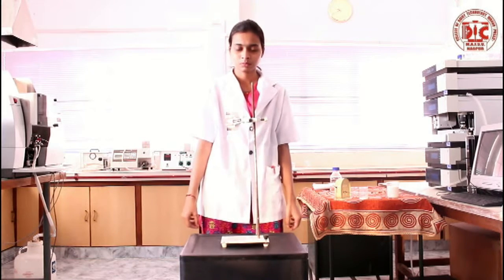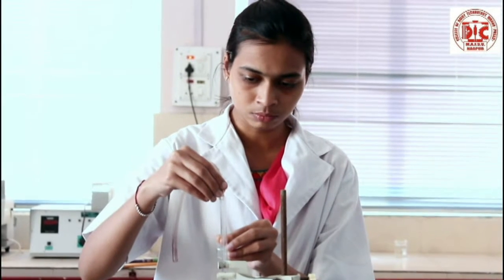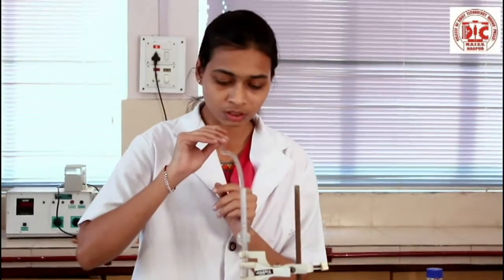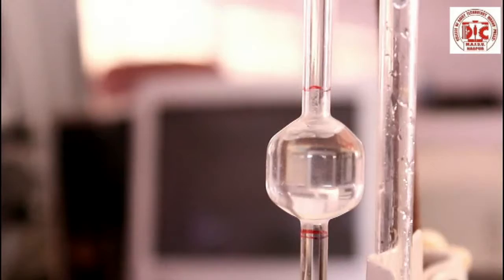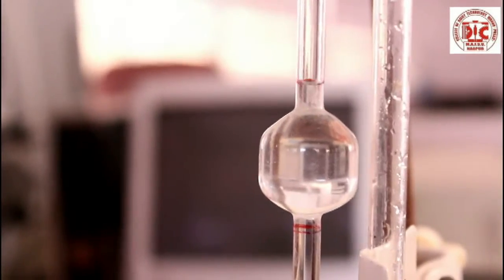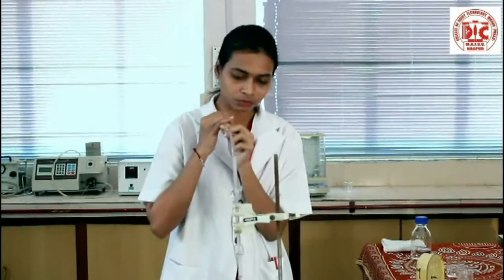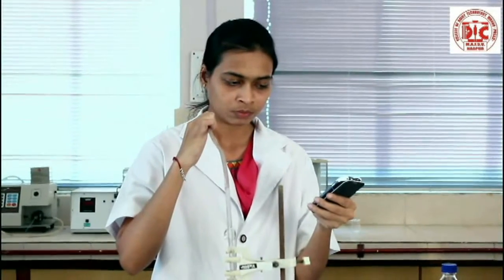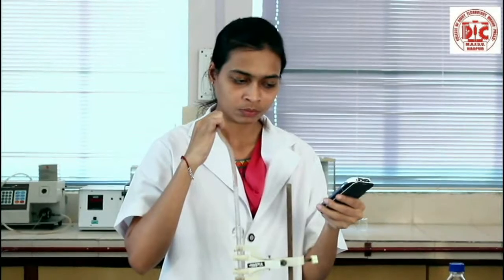At 20 degrees Celsius, attach rubber tubing to the arm of the viscometer containing the marked bulb and draw distilled water over the upper mark. Close the rubber tube with a finger and release the pressure slowly to allow the water to flow down.